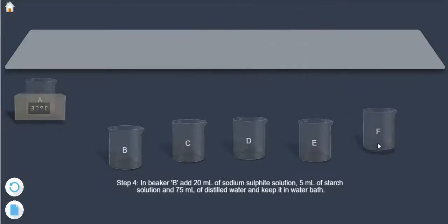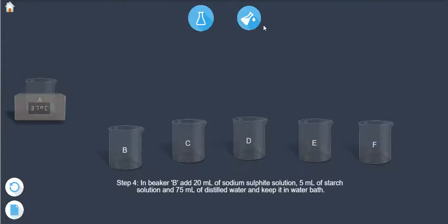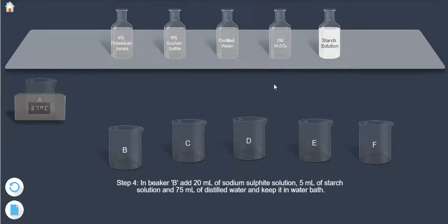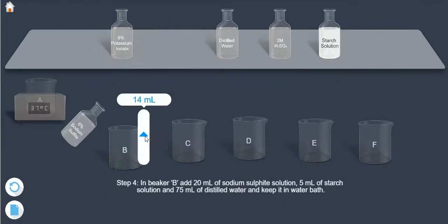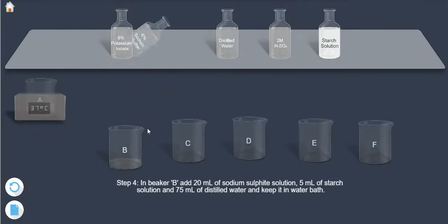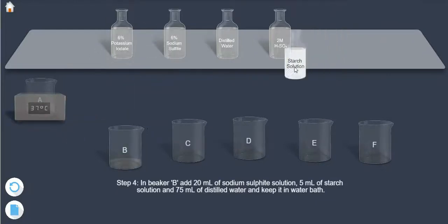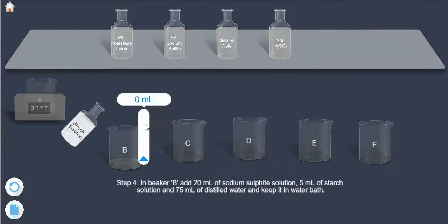Step 4: In beaker B, add 20 ml of sodium sulfite solution, 5 ml of starch solution, and 75 ml of distilled water, and keep it in the water bath.